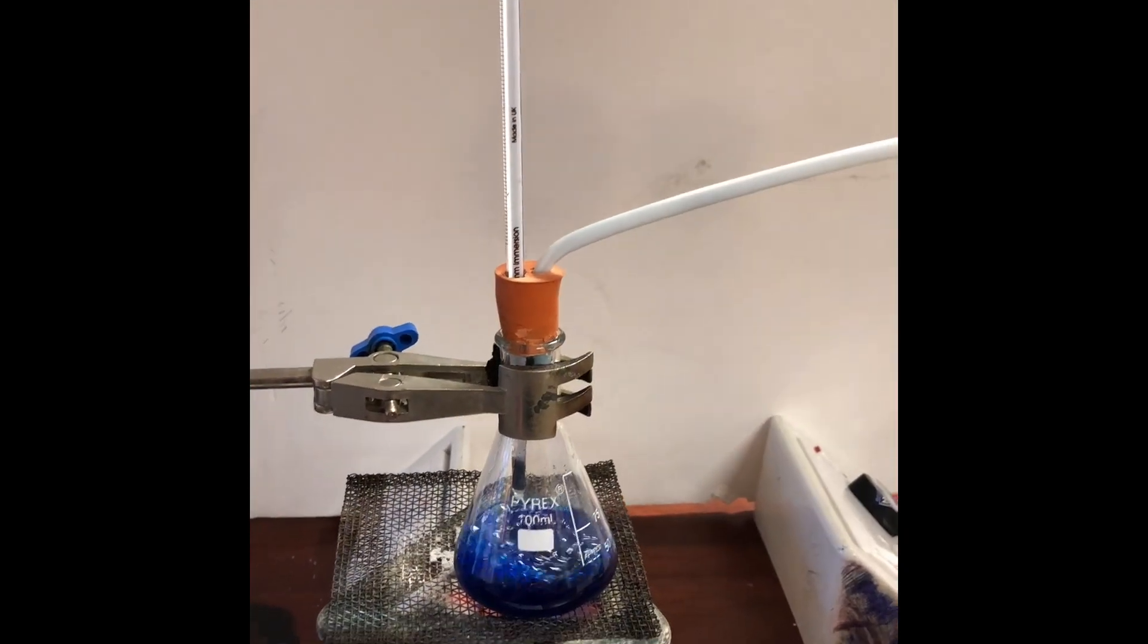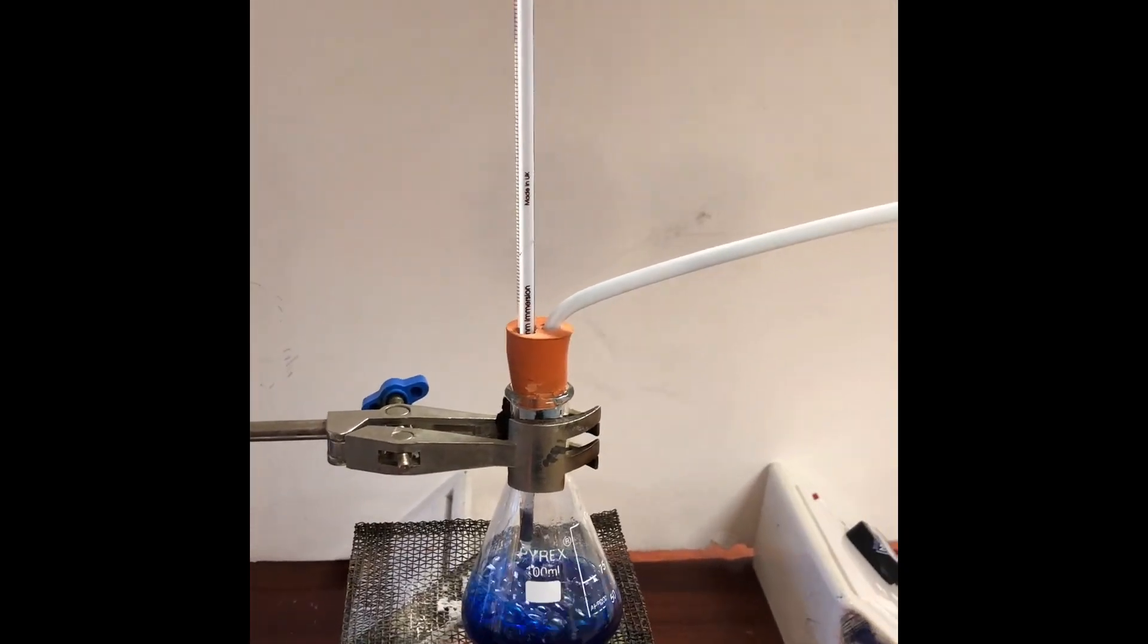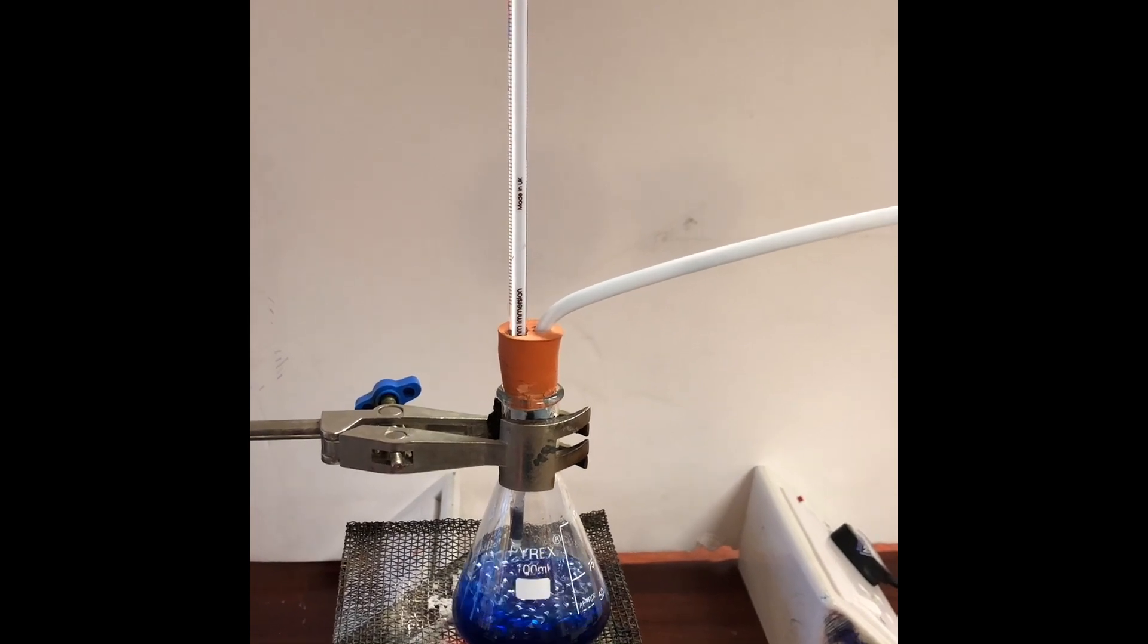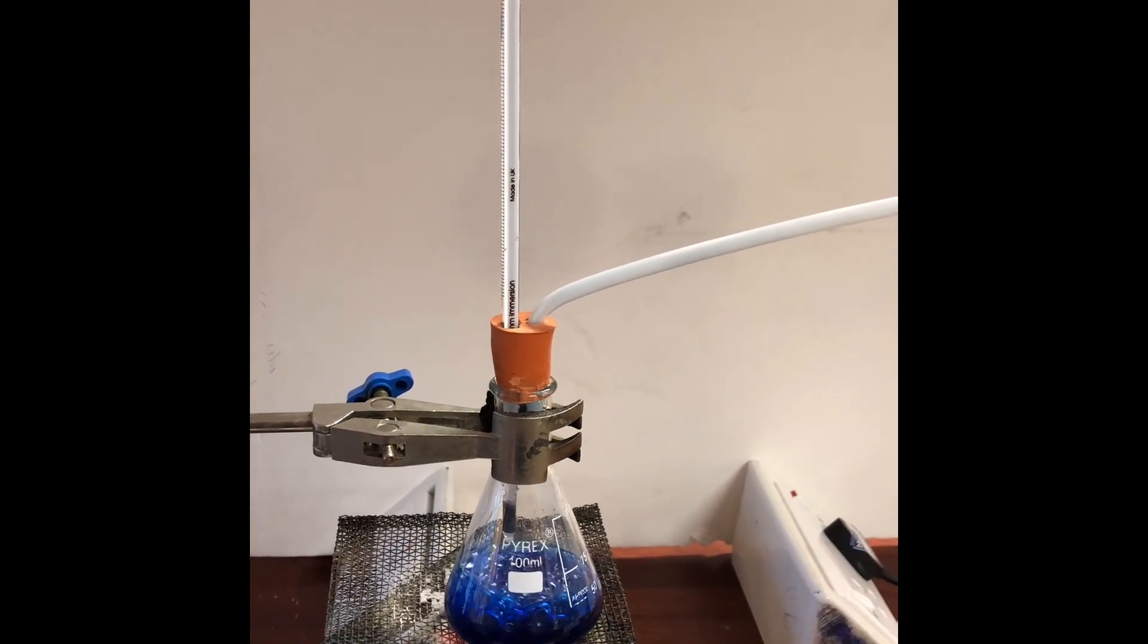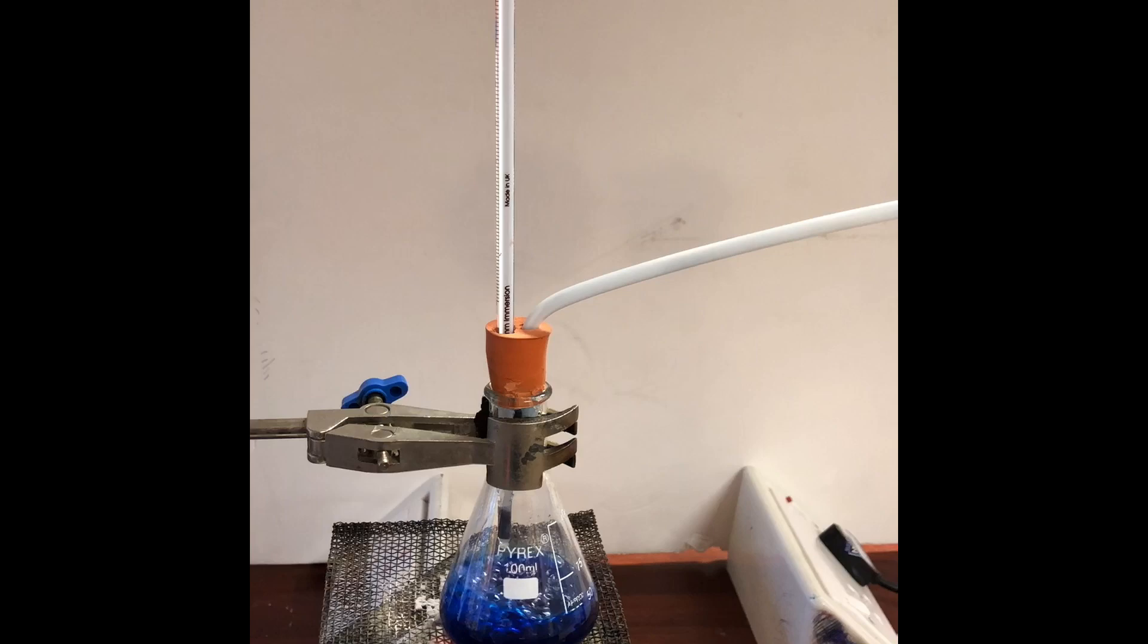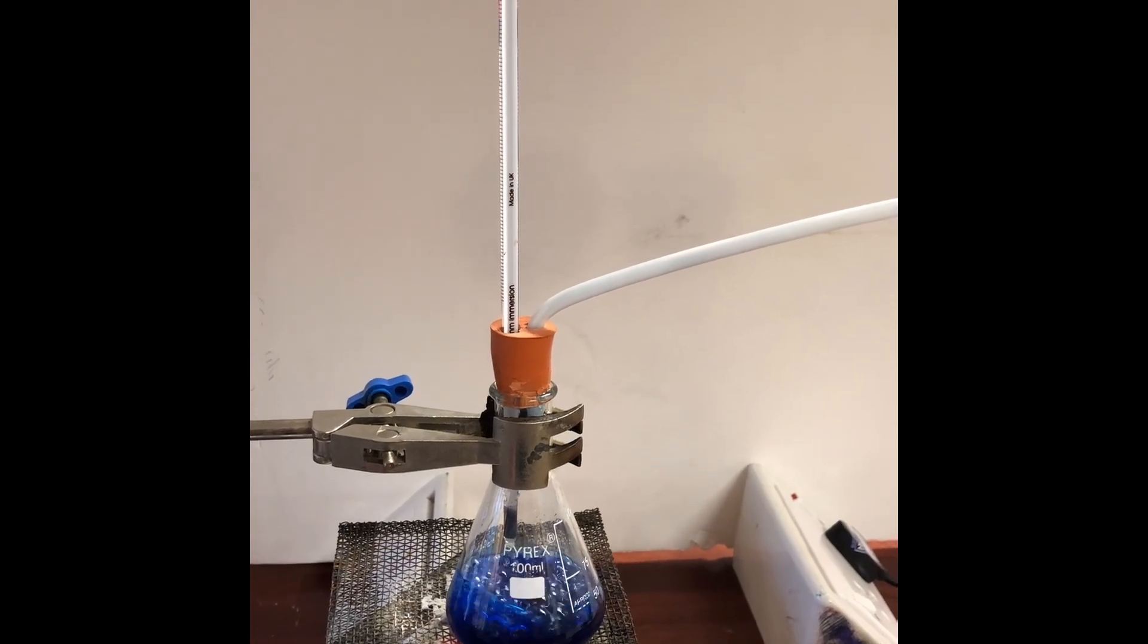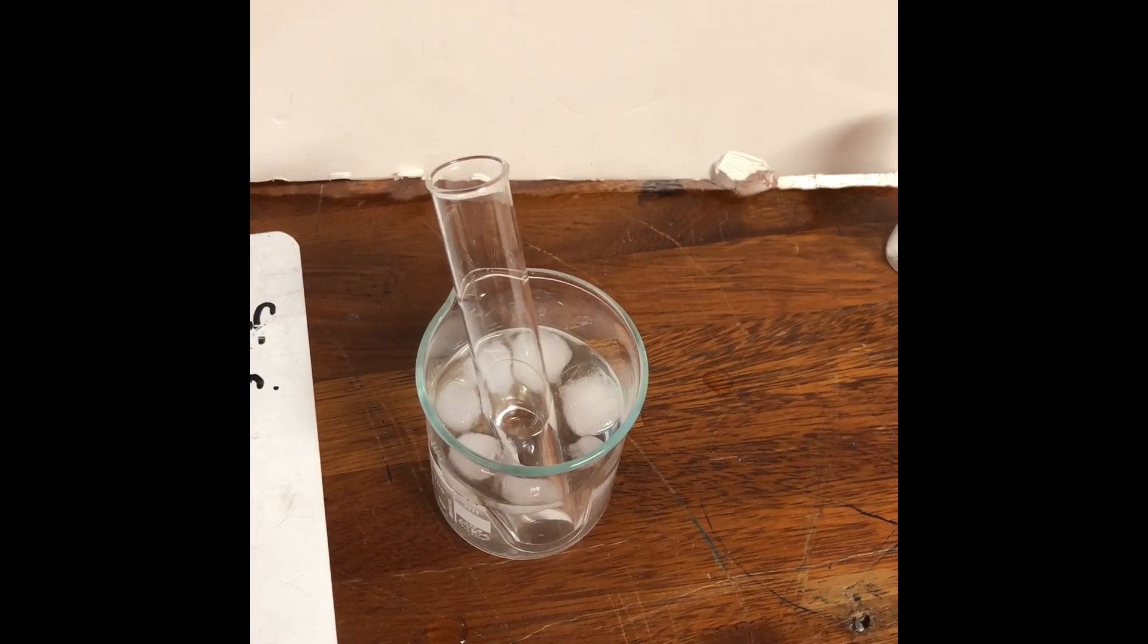Being careful to make sure that the temperature on the thermometer isn't above 100 degrees, because that's the temperature that water boils and we want the water to come off. If we allow it to get hotter than that, then the ink will start to boil off and that would defeat the point. Let the experiment run for a while now.